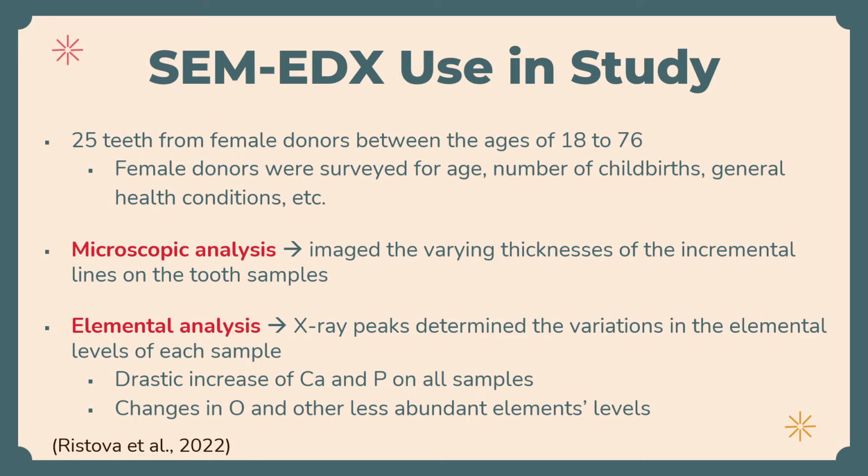SEM EDX was used for both microscopic and elemental analysis. Specifically for the microscopic analysis, samples were imaged, measuring the varying thicknesses of the incremental lines on each of the tooth samples that were collected.